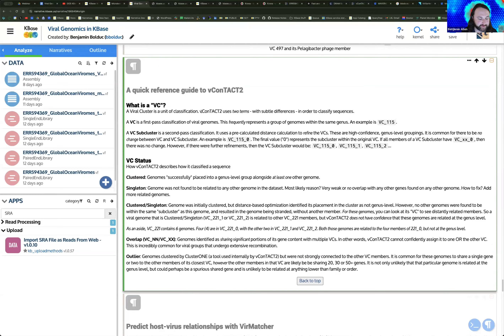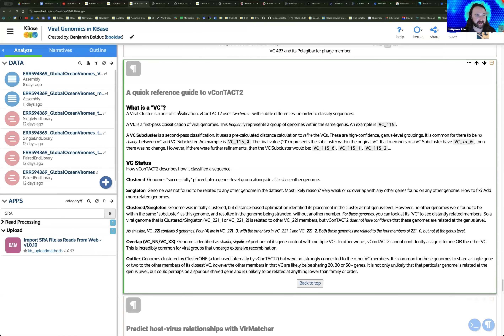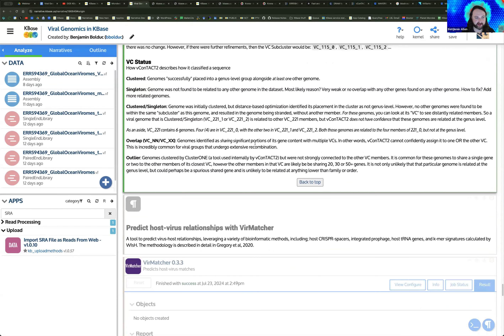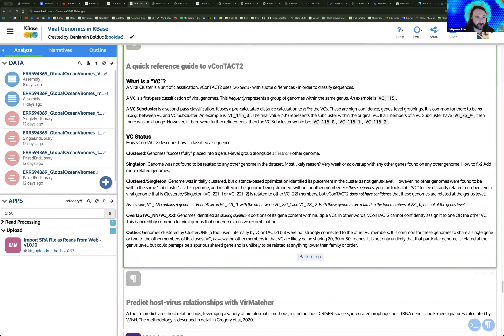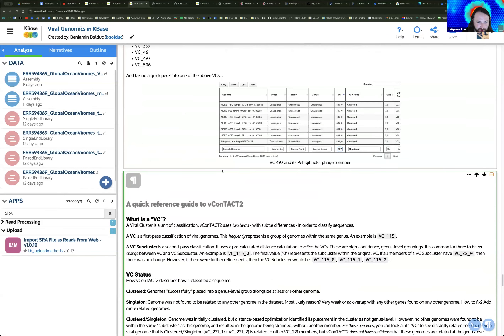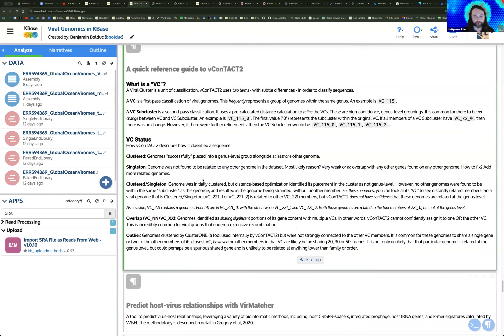There's additional reference material for V-Contact2 in this example narrative where you can look at ways to understand what the status means in different sections of the report — for example, what the difference between 'clustered' or 'singleton' means. It takes a little bit of finessing to find the hits in the V-Contact2 report, and you may want to pull this data off of KBase to do that, but you can at least get a sense of how to explore the report and identify hits.